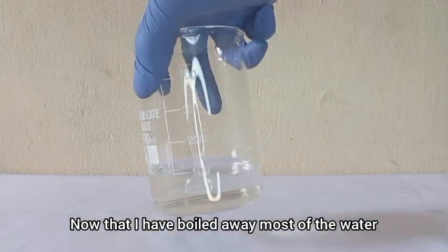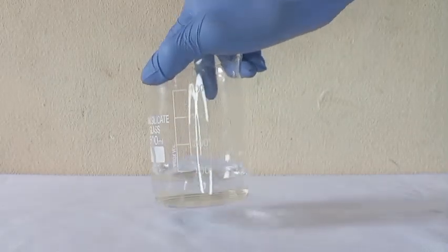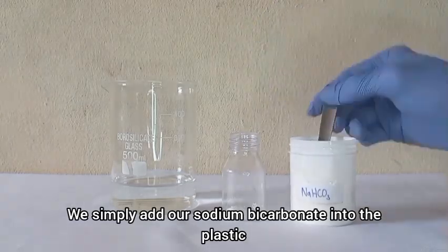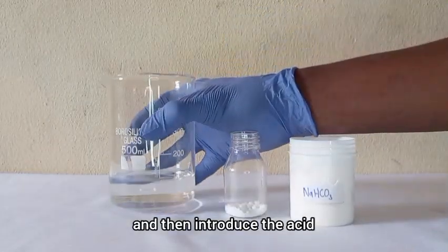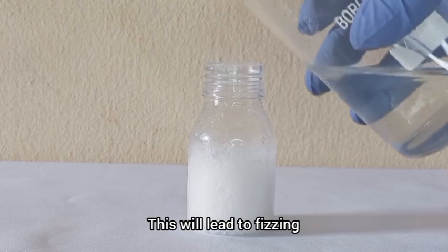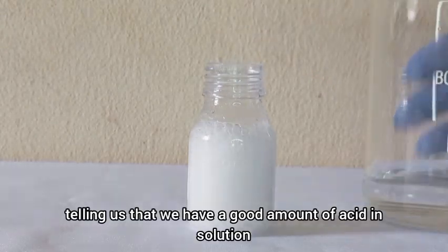Now that I have boiled away most of the water, we have our fairly concentrated acid. To test it we use the famous bicarbonate test — we simply add sodium bicarbonate into a plastic container and then introduce the acid. This leads to fizzing, telling us that we have a good amount of acid in solution.